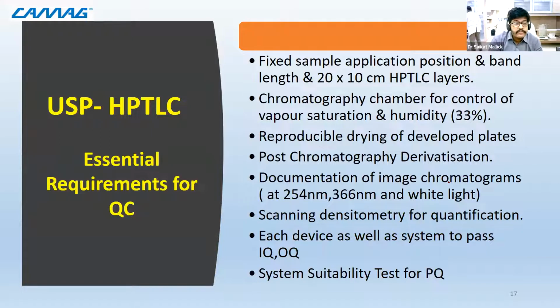So post chromatographic derivatization is an important aspect, and that has to be recorded when you are finally doing an experiment which is of the validation part. Now, validated methods will be important when you go for bioautography studies and go for publication. So validation is an important step, and that is why I'm talking about these parameters.